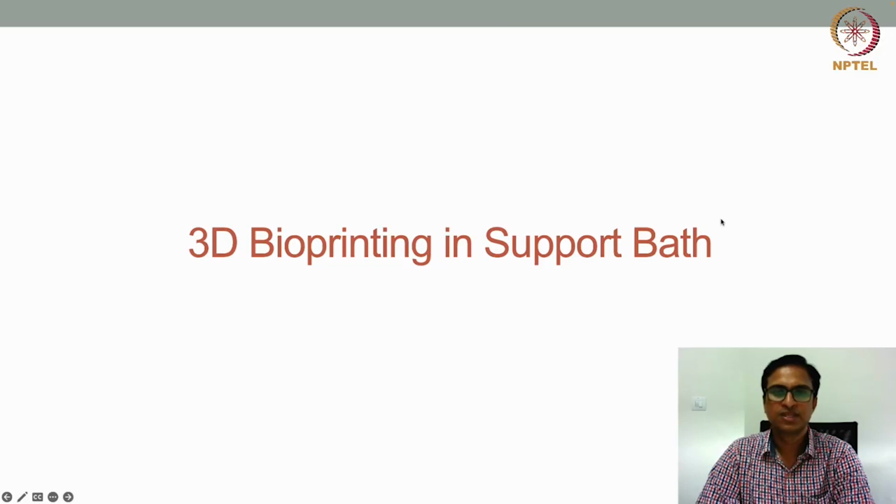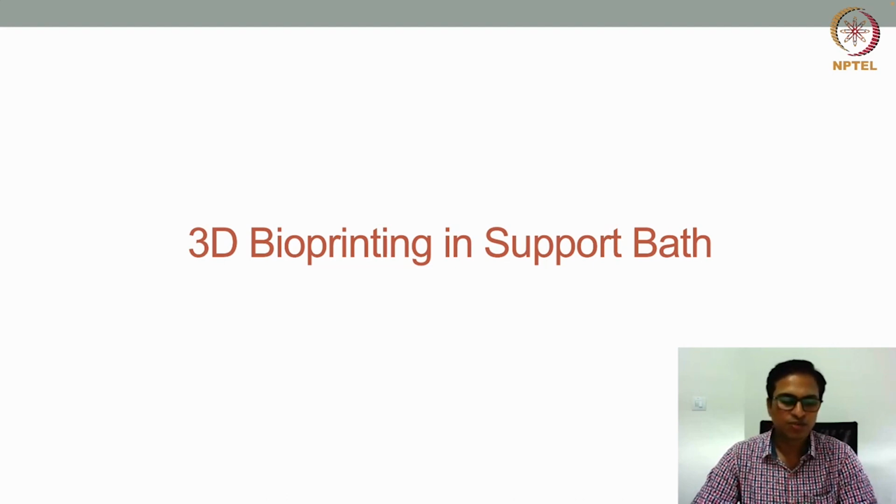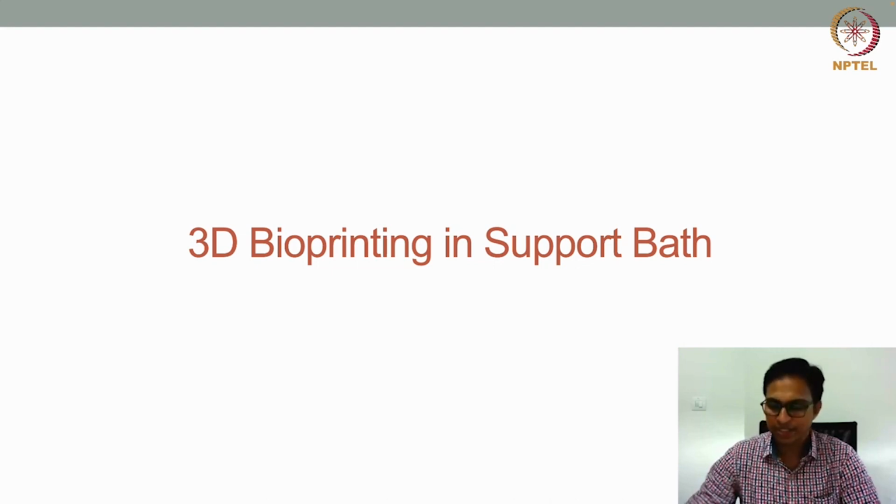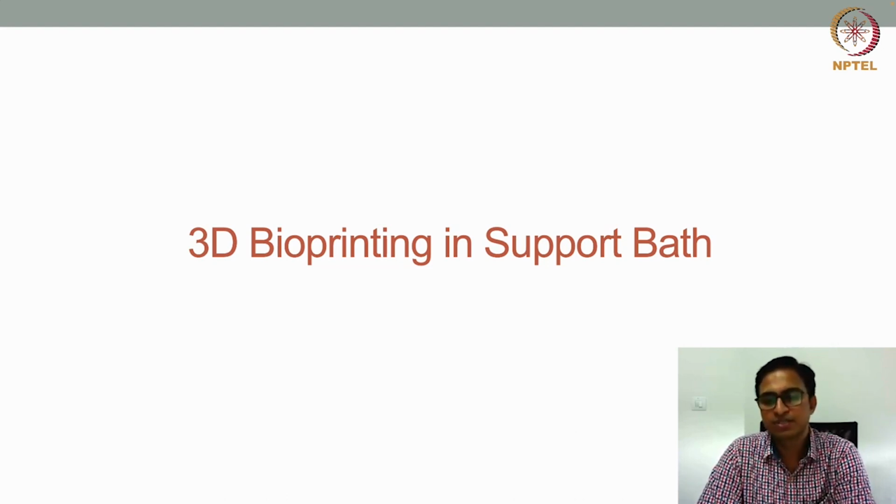Dear students, welcome back to the organ printing course. In the last few lectures, we have discussed different types of 3D bioprinting technologies like inkjet bioprinting, extrusion-based bioprinting, and laser-assisted bioprinting. We also discussed in great detail the characteristics and important features of these technologies, the different components of these bioprinters, and their advantages and disadvantages.